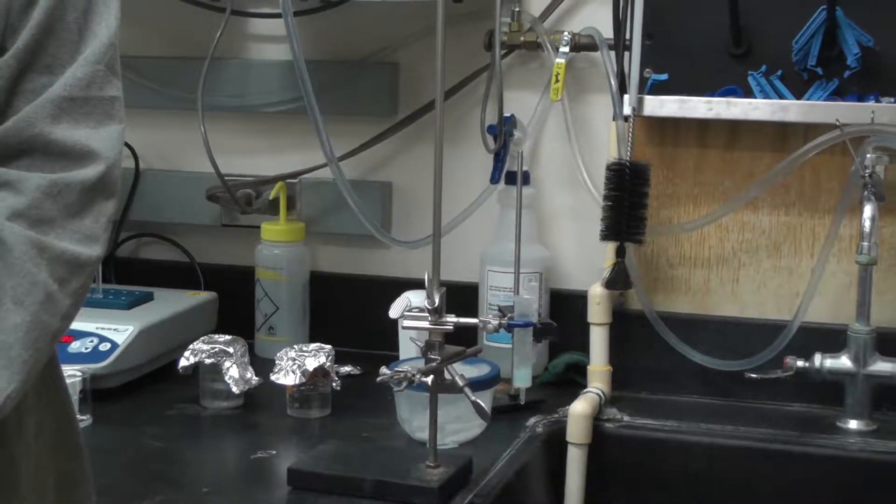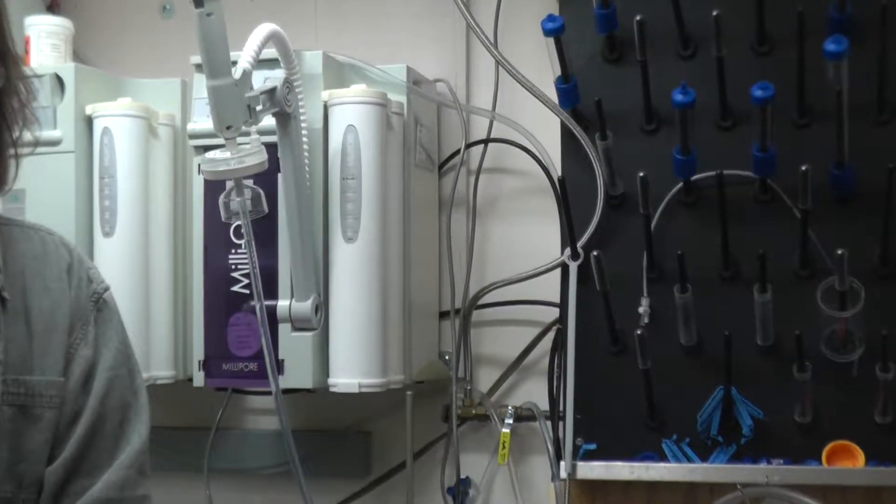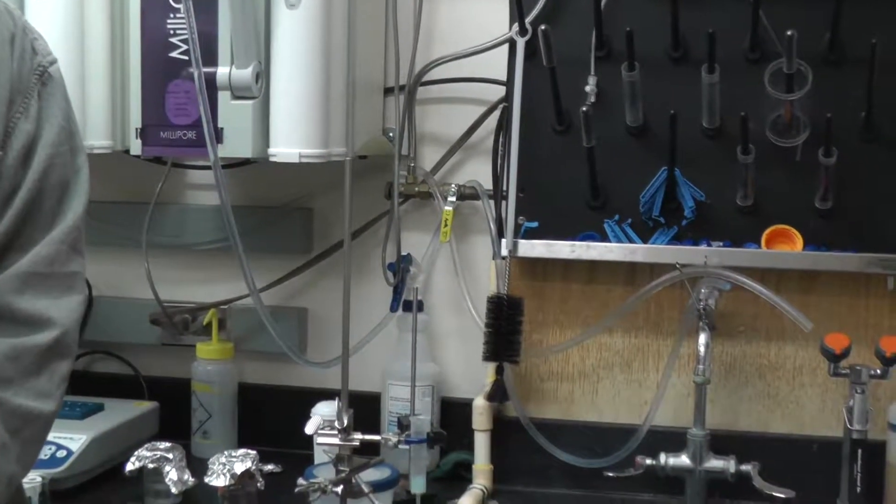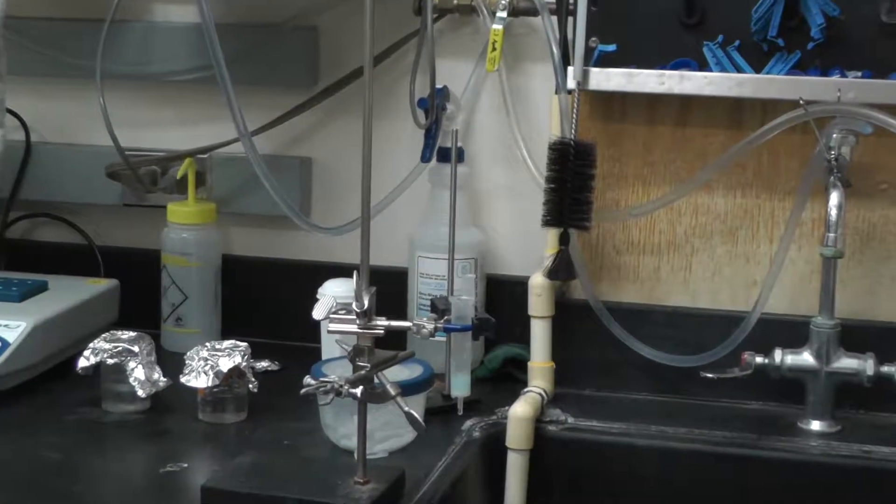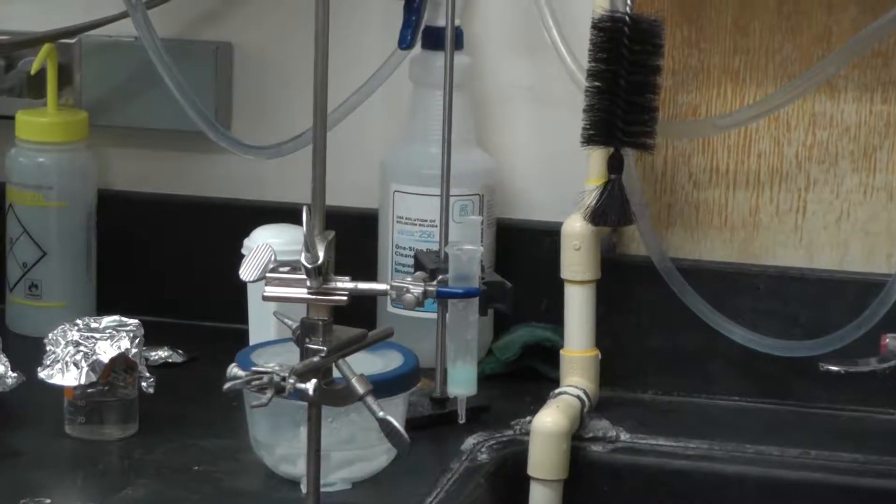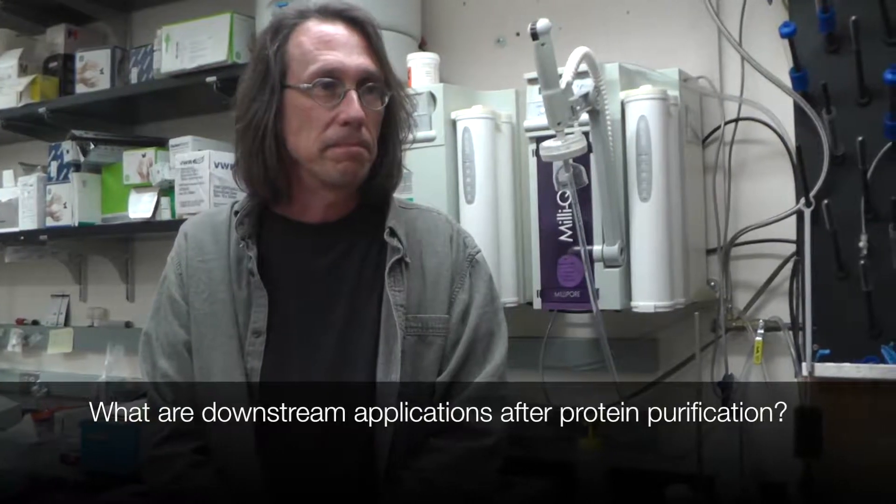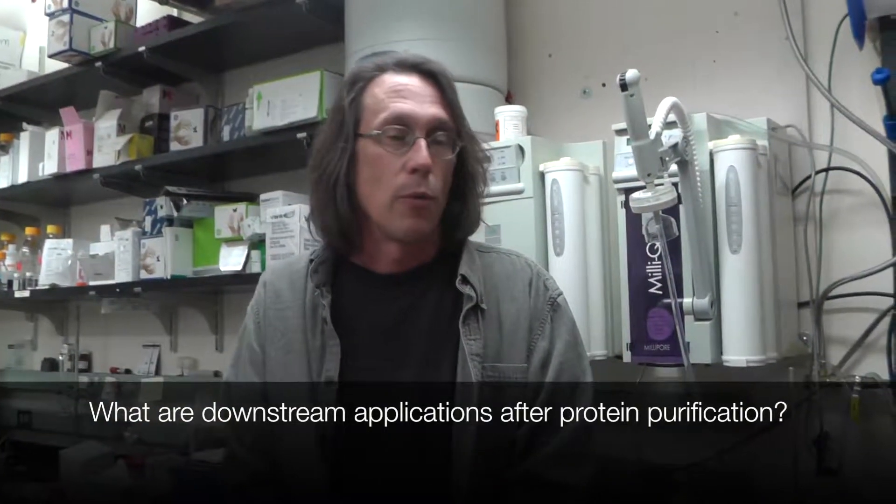Most of our work is just gravity flow columns, washing by hand, and eluting in imidazole solutions. Imidazole to sort of release the six histidine from the nickel NTA. Once we've purified the protein, we label it with fluorescent dyes and then we construct different experiments in a fluorescence microscope where we look at interactions of these proteins with DNA substrates.